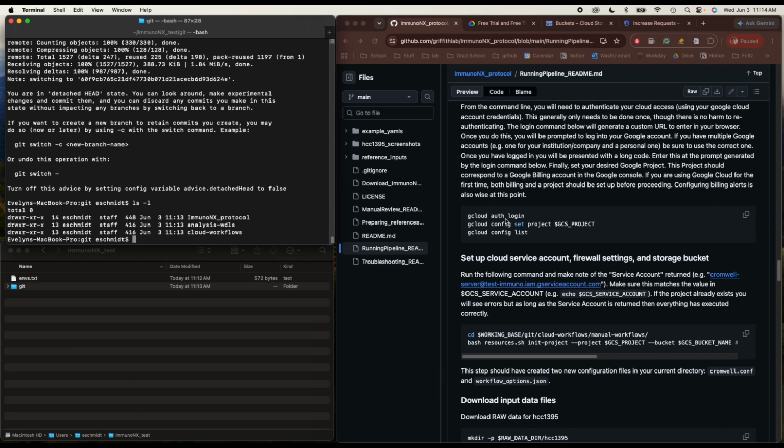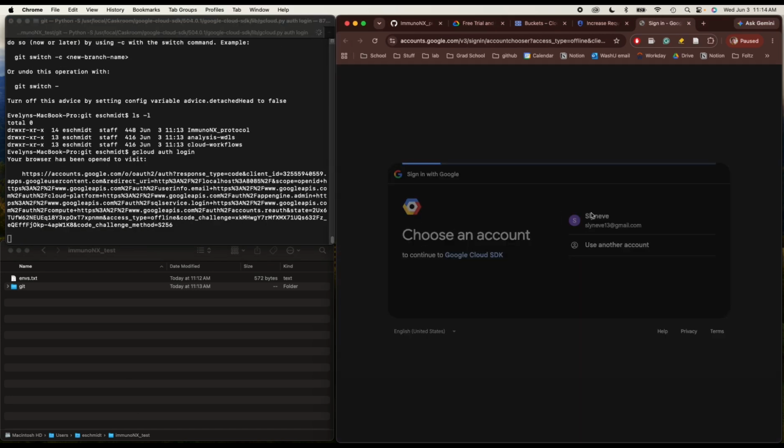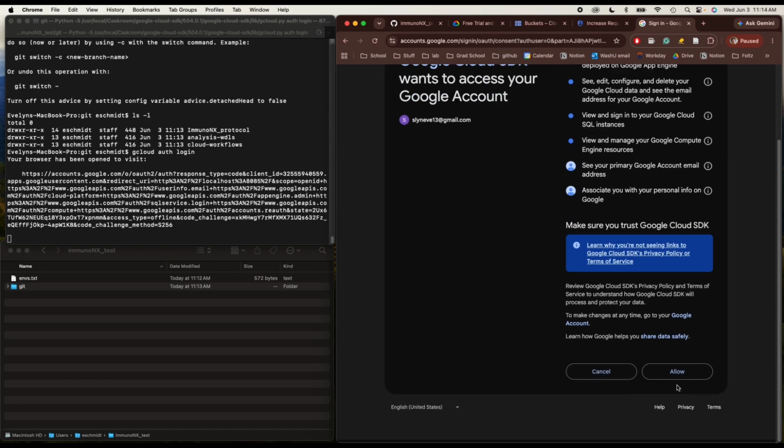Okay, so we logged in already, so we don't have to run it again. We can, I think it will just make us do the same thing. Yeah, open the account, you authorize everything.